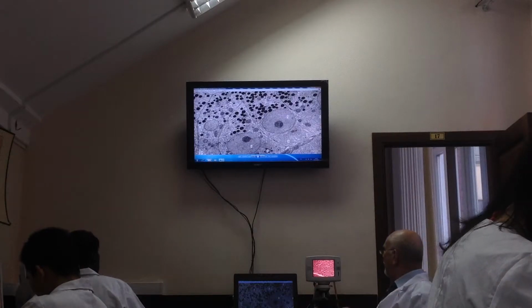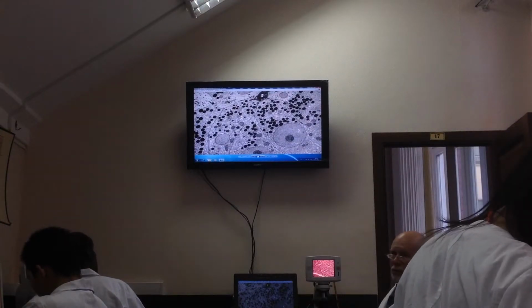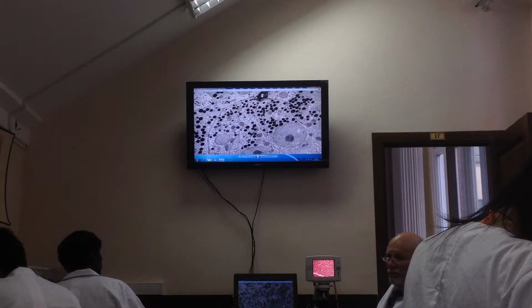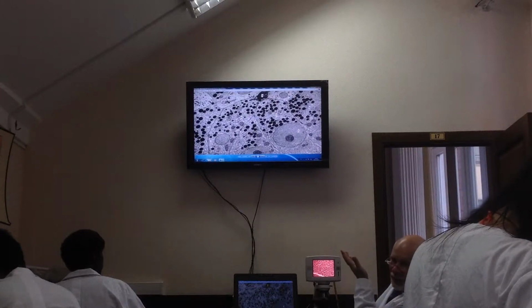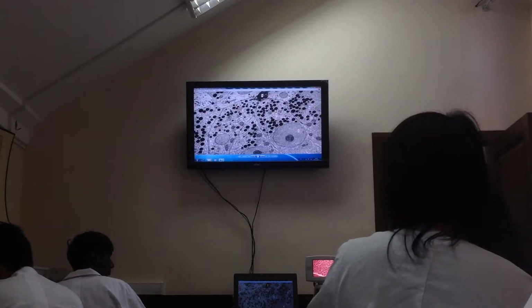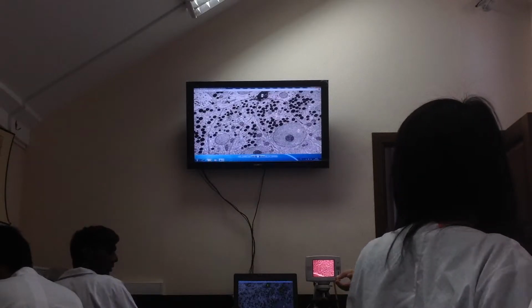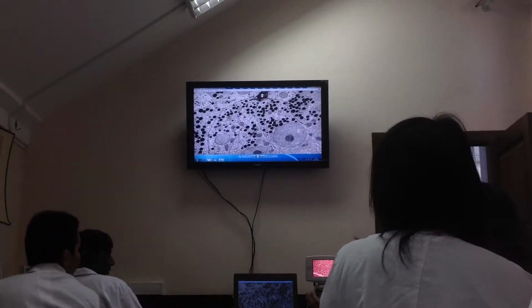Understand? Apical pole of the cells. In the apical region above the nucleus, you see numerous secretory granules, granules containing the enzymes synthesized by the acinous cells. What enzymes? We cannot reveal the enzymes under the electron microscope, but with biochemical methods we can extract enzymes, and now we know what these granules contain. Enumerate the enzymes secreted by the acinous cells.